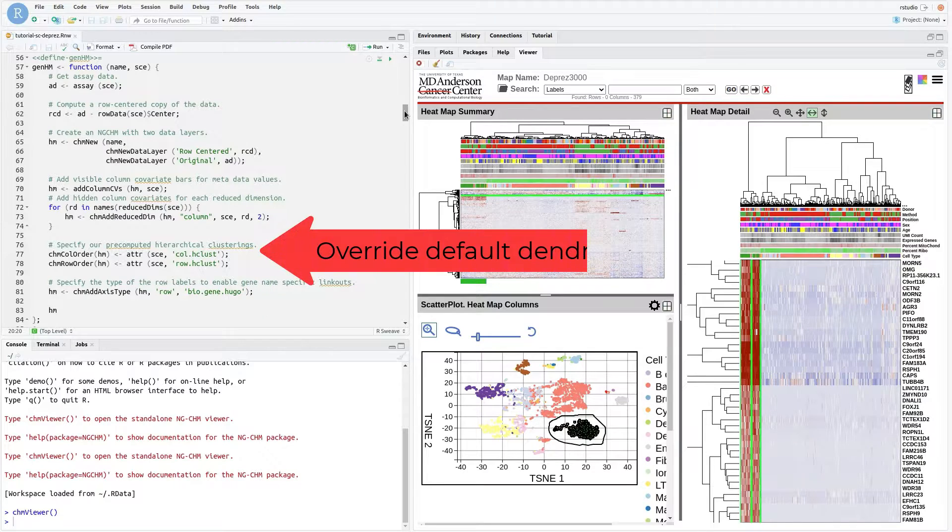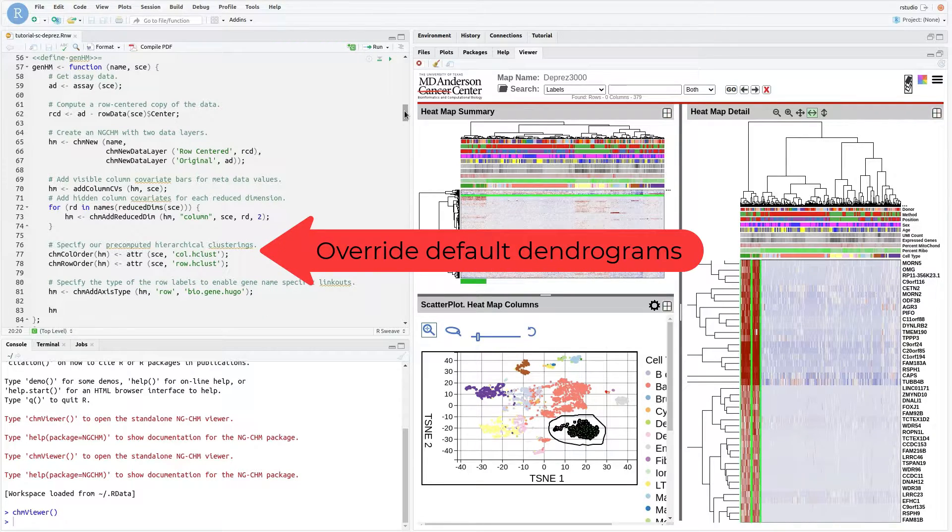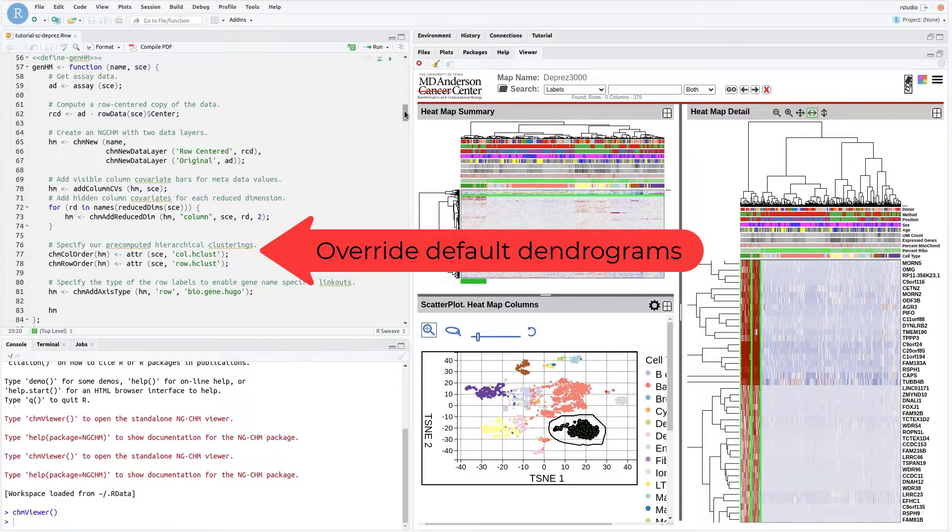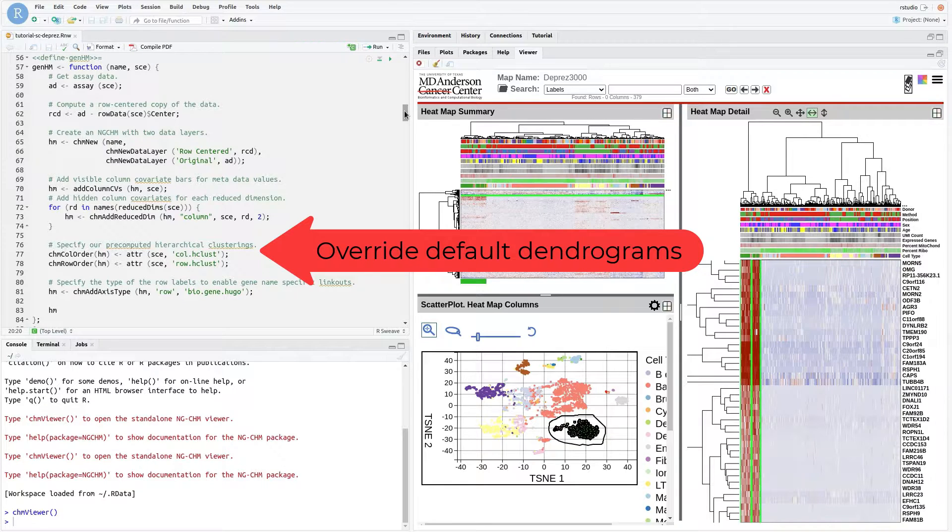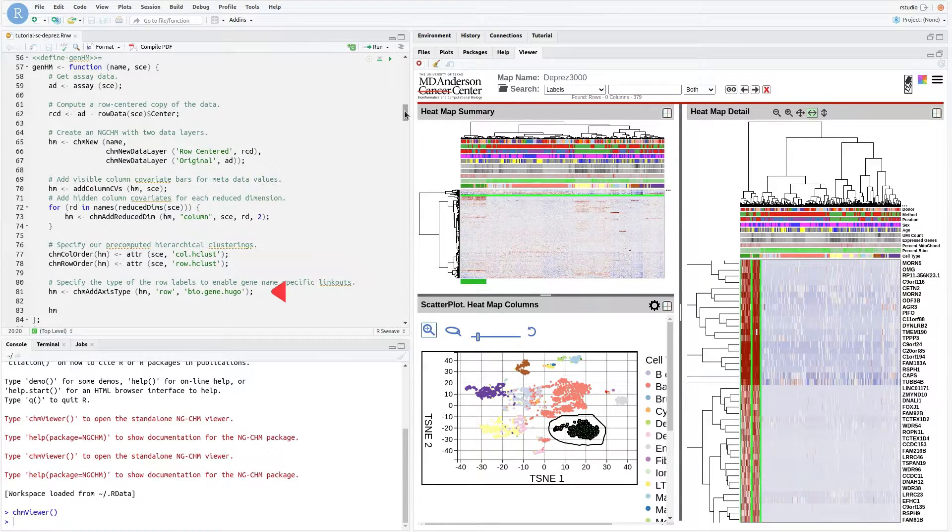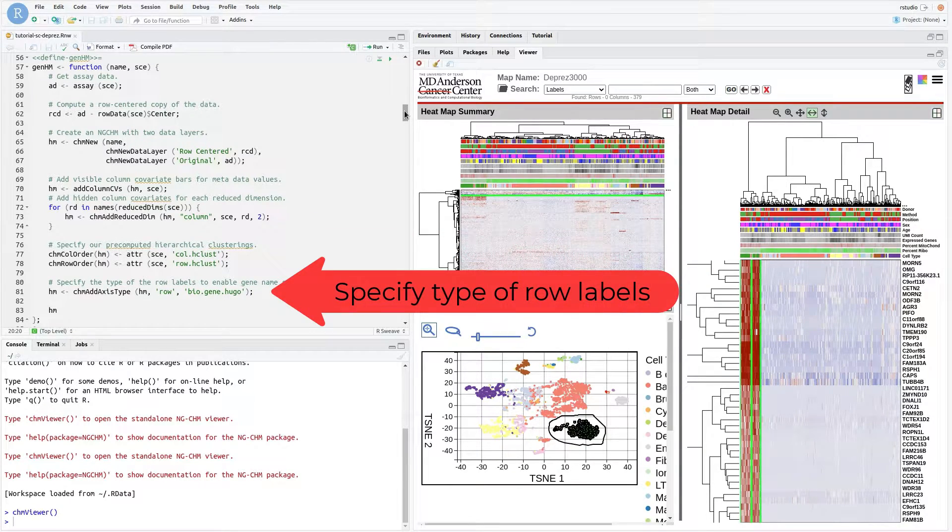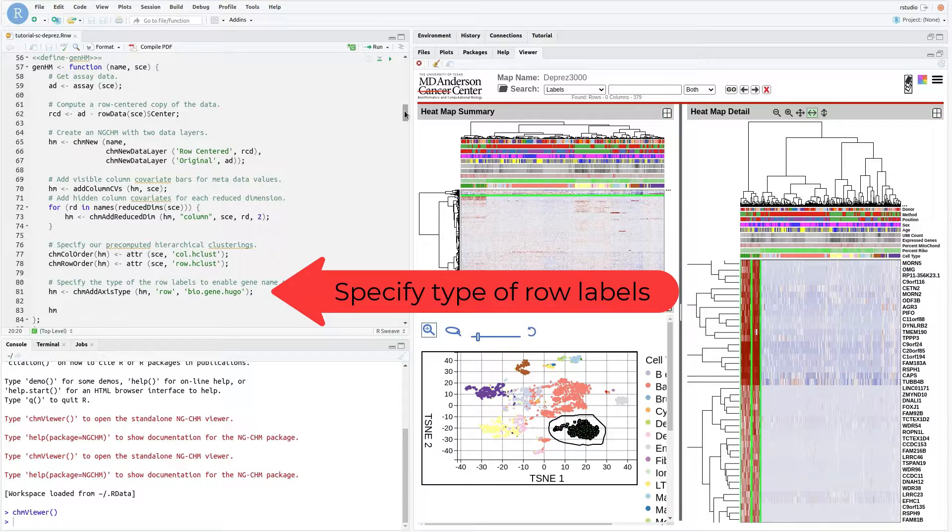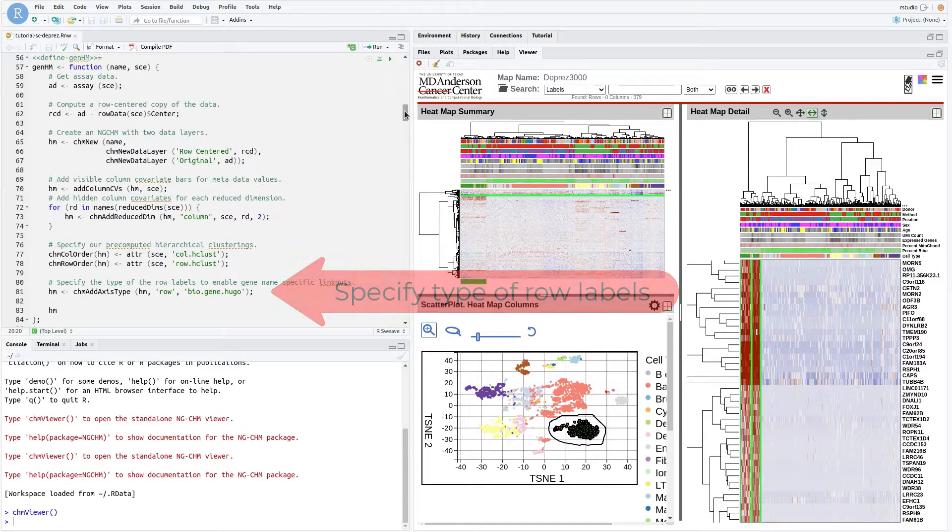Next, we override the default NGCHM clusters with hierarchical clusters that we have pre-computed and attached to the single-cell experiment object as attributes. Finally, we specify the type of the row labels to enable gene name-specific linkouts.